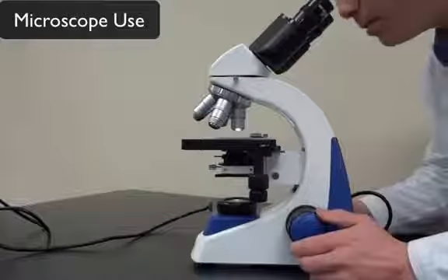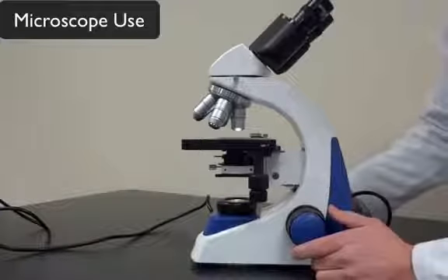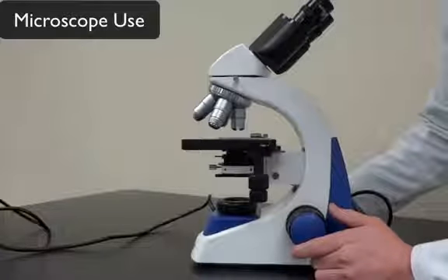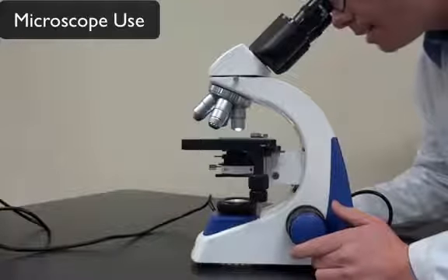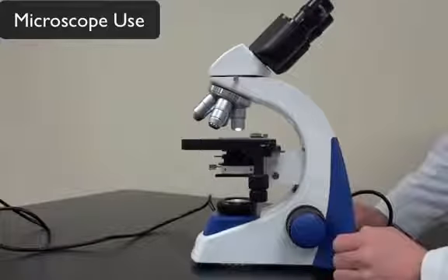Now, when you're viewing in any objective lens, you can adjust the light source here, so you can change the light intensity. You can see how much the light intensity goes up from here to here. So there's quite a bit of change, and that's going to change sometimes what you can actually see on the slide in the specimen. So you might want to manipulate that and experiment with that.